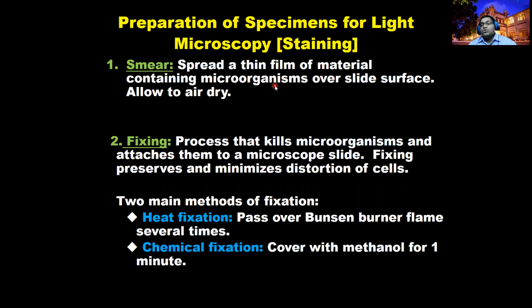Certain microscopic organisms, organs, or structures present in that microorganism could not be seen very clearly under the microscope without proper staining. Therefore, there are certain chemicals and liquids you should use to stain different parts or different components of the microscopic organisms, right? This is a procedure: how to stain the material before observing the microscopic organism.